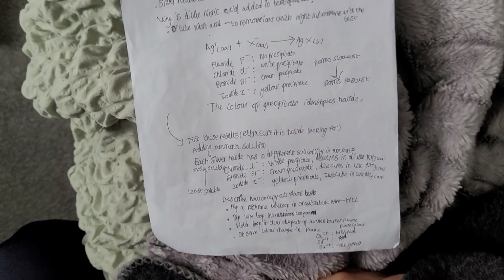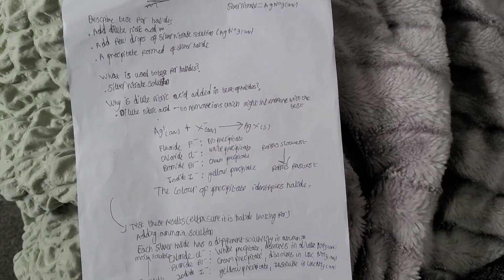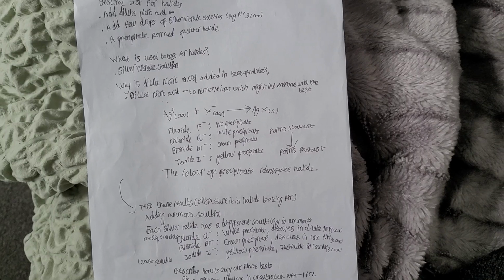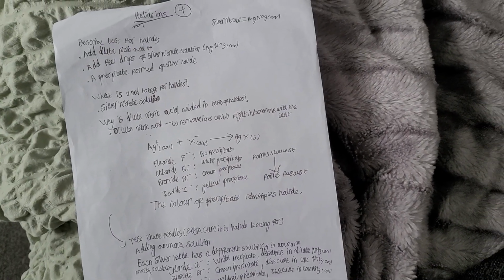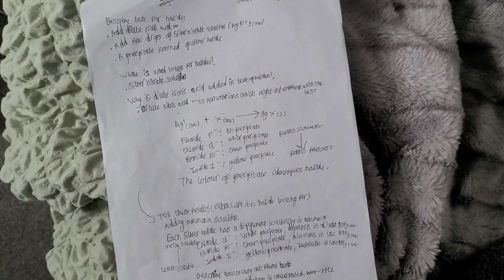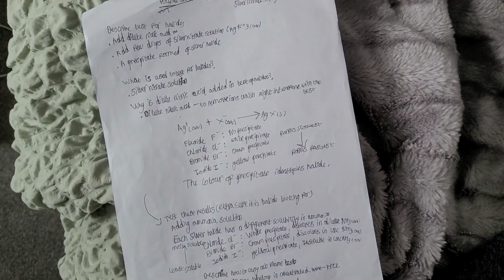Halide ions. So, describe the test for halides. Well, we want to add dilute nitric acid, then we want to add a few drops of silver nitrate solution, AgNO3 aqueous, and a precipitate of silver halide forms. So pretty simple: add dilute nitric acid, add a few drops of silver nitrate solution, AgNO3 aqueous, and a precipitate of the silver halide forms.